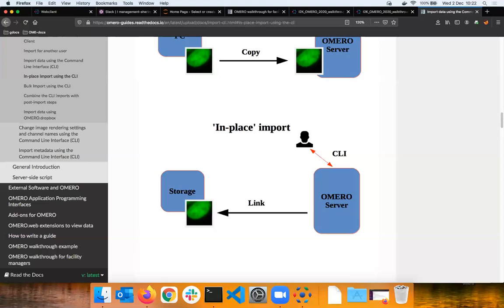You will need a process that makes that linkage happen. It's not going to happen by itself; it's not watching the folder. For that, we had something called Dropbox in the past, but that's a different thing. What you are thinking of is more when people put something into a Dropbox and then that will automatically get imported.